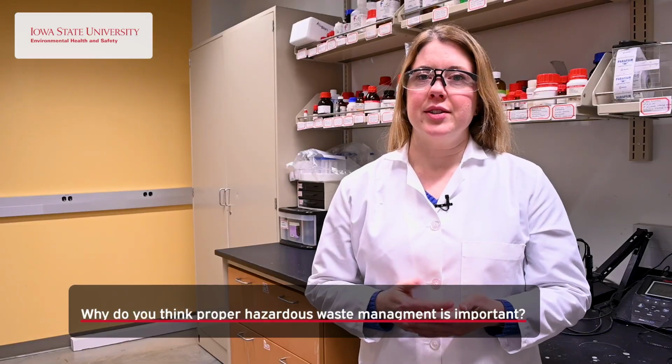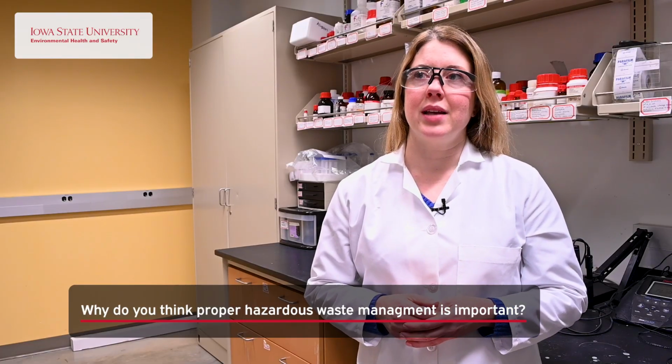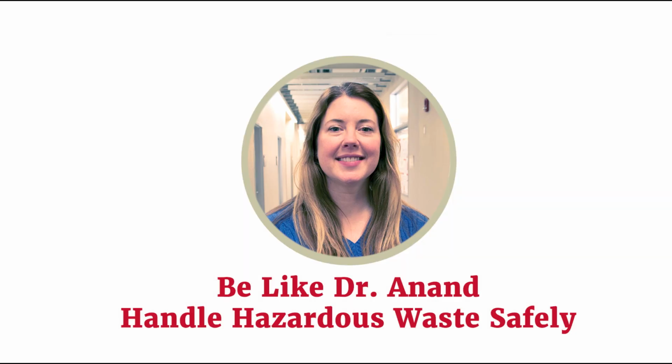As a research advisor, laboratory safety and waste management are important to me because I want the lab culture to be one where everyone can focus on research and not have to worry about being in an unsafe environment.